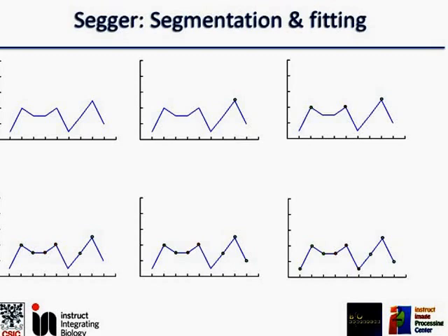Then I go to the next highest density values, this one here and this one here. I check whether this voxel is a neighbor of another region. It is not a neighbor, because there is this voxel in between, and these two are not neighbors of each other either. So this defines another segment, and this is another segment.